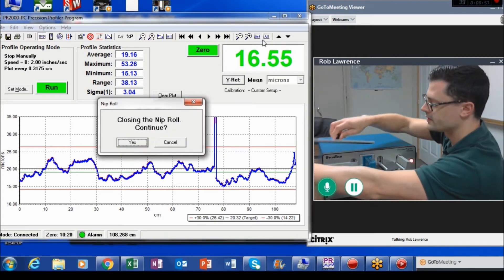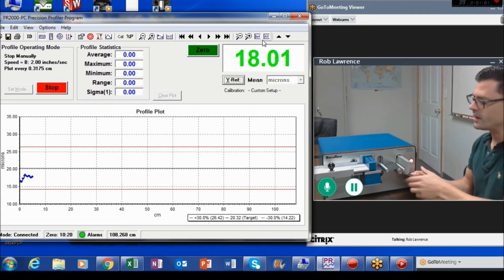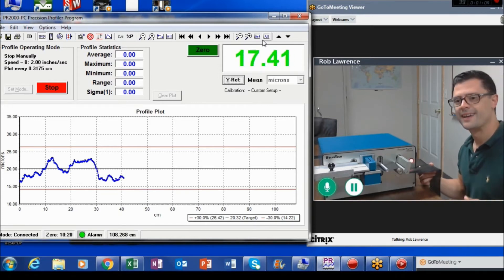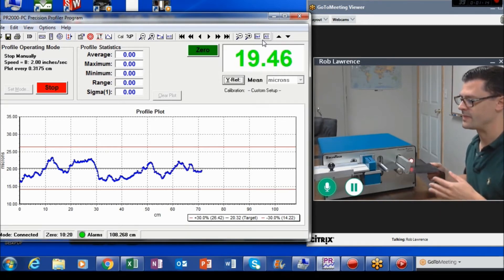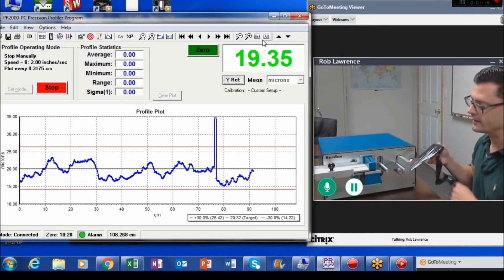I go ahead and close that, and start the profile. Right now I'm taking a reading every eighth of an inch. You can see the live data there on the screen. And now, after I'm done the run, I'm going to overlay a run I just did before this run, so you can see how closely those runs match and see the repeatability of the instrument. That run will show up as a red line.